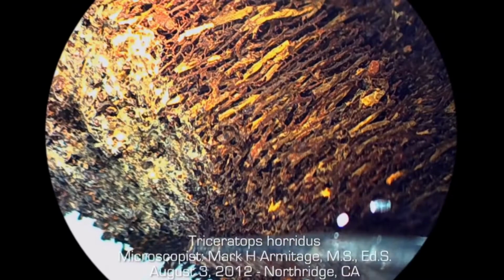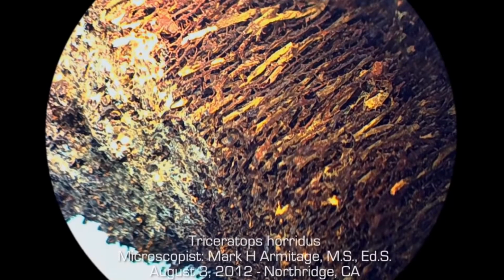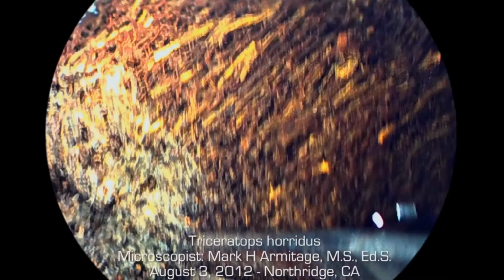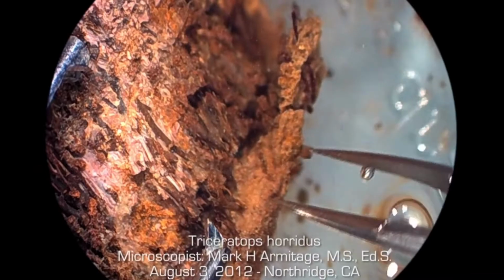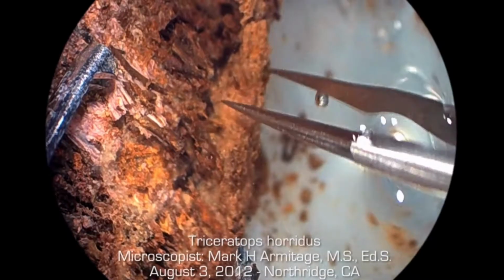See the fibrous material there? That's part of the composition of the bone matrix itself. But what's really of interest is the white material here on the surface, swaying back and forth. That's actual dinosaur tissue on the surface. This is not a solid fossil. This has tissue characteristics to it. Notice how it flexes back. It's very interesting how you pull on it, it flexes back, pull on it, flexes back. That's characteristic of tissue. That's what tissue would do.